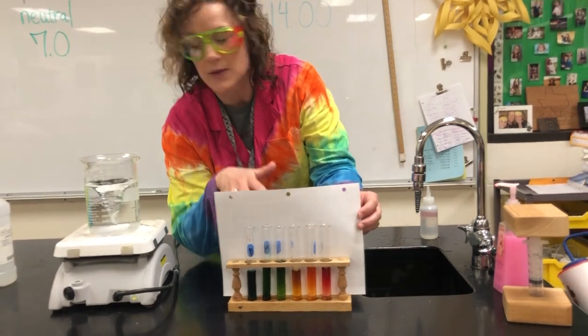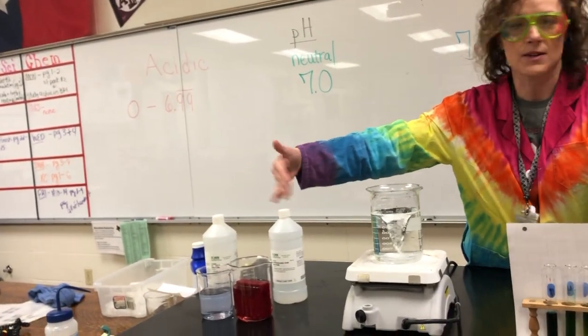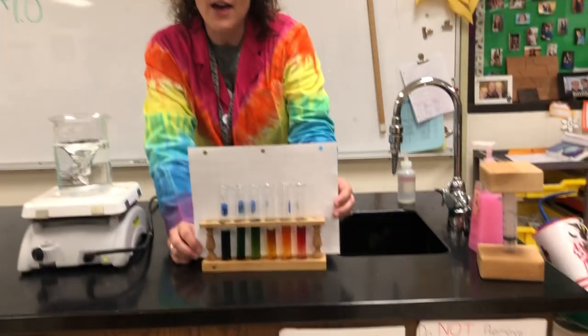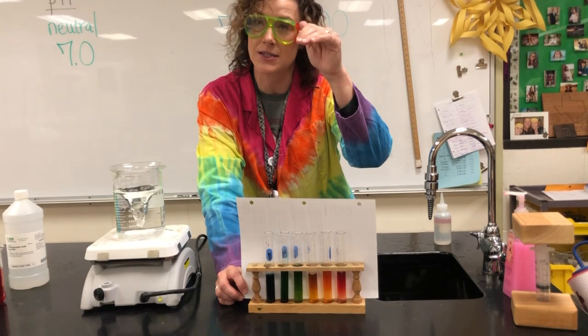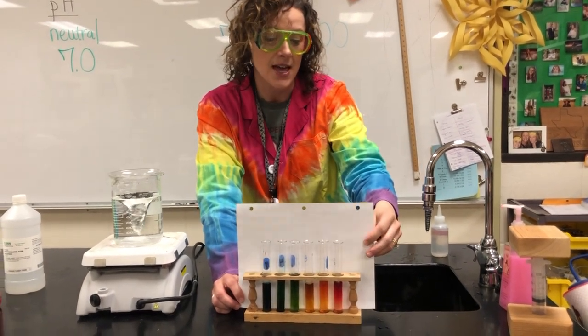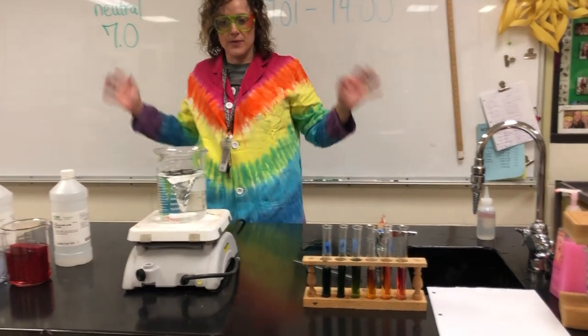Now this one's a really cool one. If we go back to this guy, it can only do 2 colors. So it can be red or it can be blue. This one can have a host, so it can do a better range of pHs because different colors indicate different pHs. I'm going to do another one that's pretty slick as an entire range.